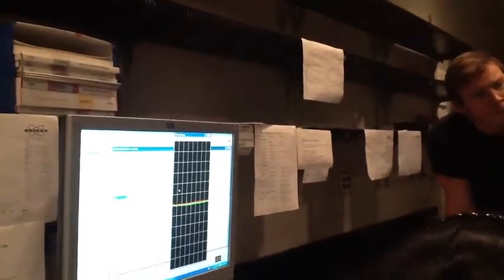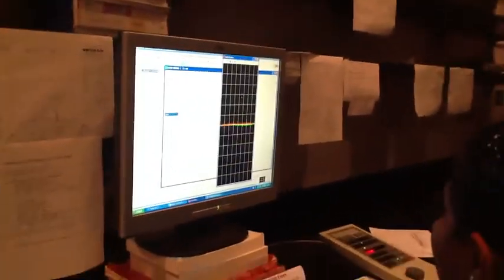Did Nichols say that? Basically, the better shimming you have, the better resolution you have, right? So it's about clarity. You want to be able to see what the shape pattern looks like, to see the splitting. Without that, if it's not good, this line is what shimming tells you, and usually it's supposed to be here. Because it's down here, it's just not going to be able to give you the option.